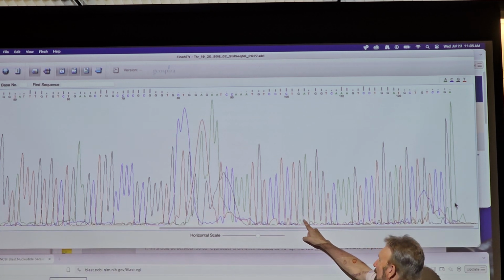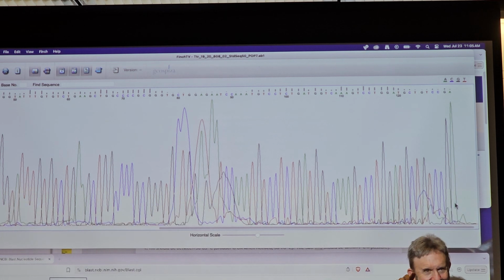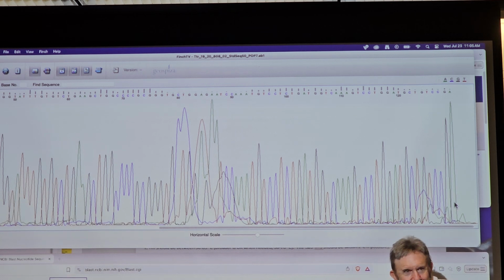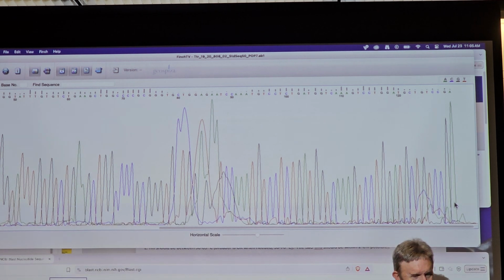Oh, it's just the fluorescence. So the instrument excites the band as it goes by, and then you get a signal from that. But the gel material is still running, and so it spreads the peak out a little bit because it's actually running as it goes past the detector. Yeah, I see your point.